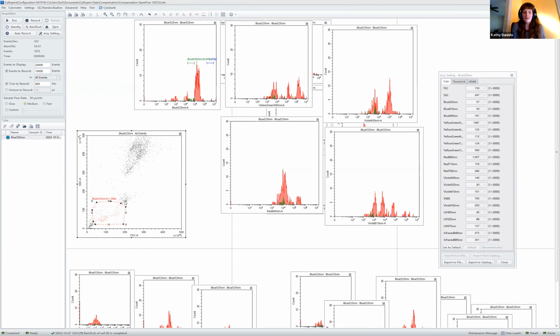So you have a high level and a moderate level of CD4, which is typical to what you would see in PBMCs. And you can pull out your lymphocyte versus your monocyte population in that way. Great question. Okay, and that's my assumption based on these particles.